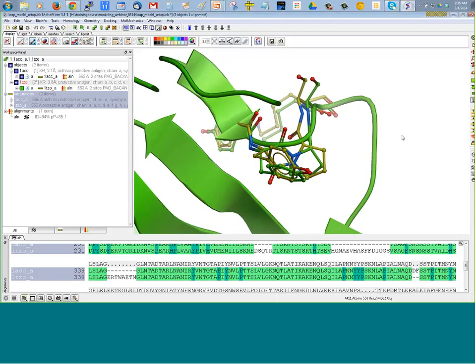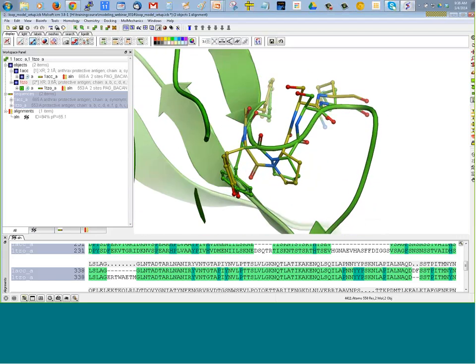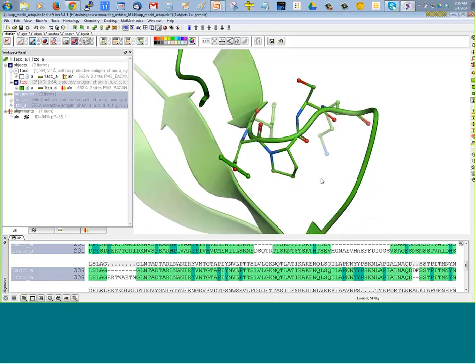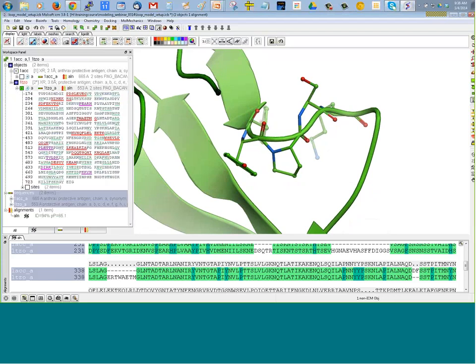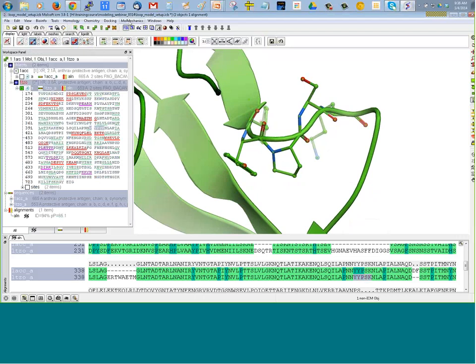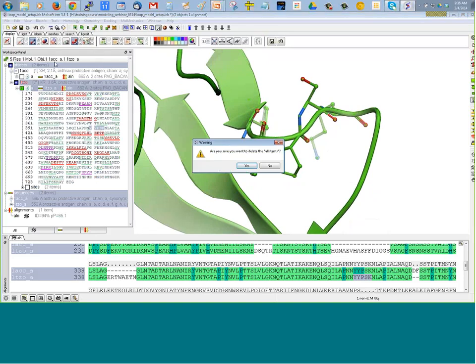So we have the protein. To sample that loop, we have two ways of doing it. You select the region that you're interested in. I'm just going to select the sticks. You go to Mole Mechanics, and there's a sample loop option. You just get to the results. I have a ready-made simulation.